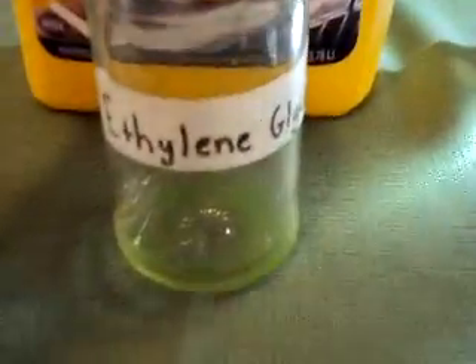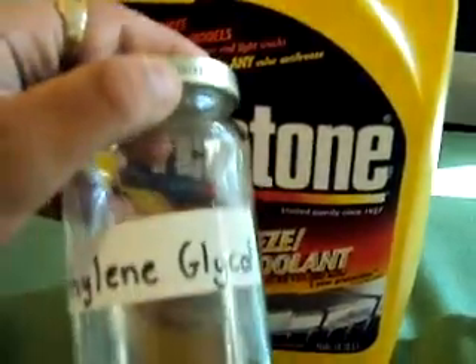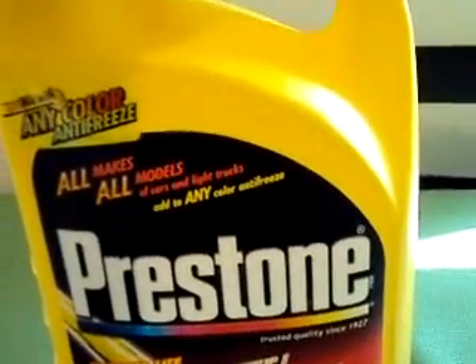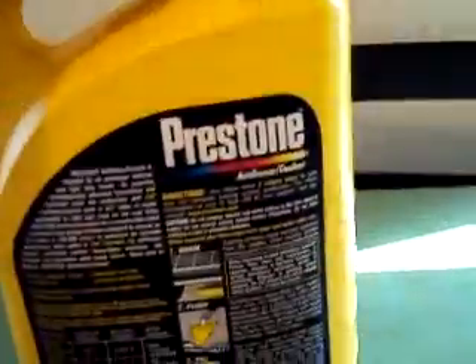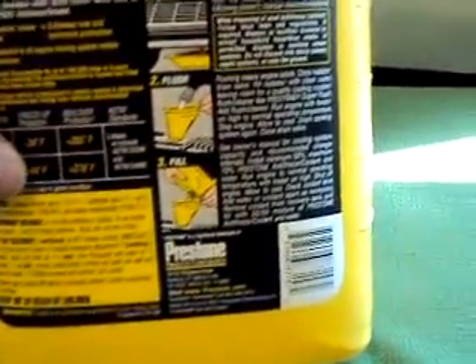Then we have ethylene glycol, which is the active ingredient in your common antifreeze coolant. You can get this obviously at basically anywhere, like Walmart. You just want to make sure that it's not the 50-50 blend that we sometimes see. You're going to want the one where the main ingredient is ethylene glycol, which will be listed first in the ingredients.